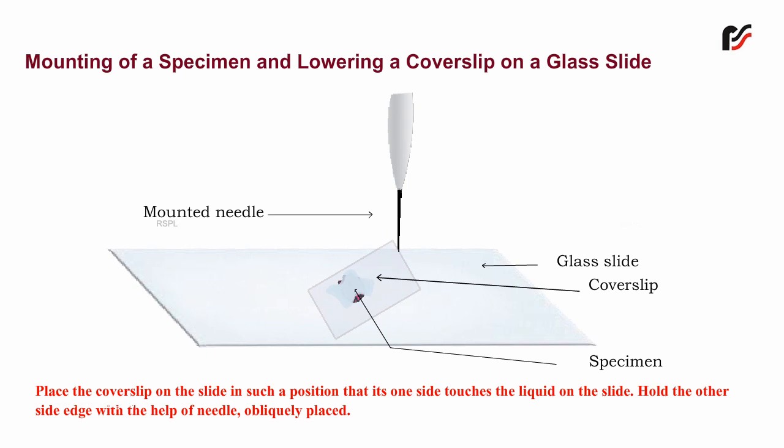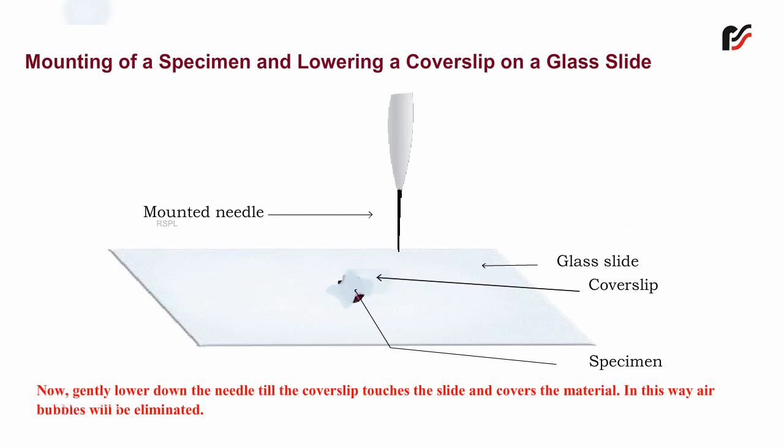Hold the other side edge with the help of a needle obliquely placed. Now gently lower down the needle till the cover slip touches the slide and covers the material. In this way, air bubbles will be eliminated.